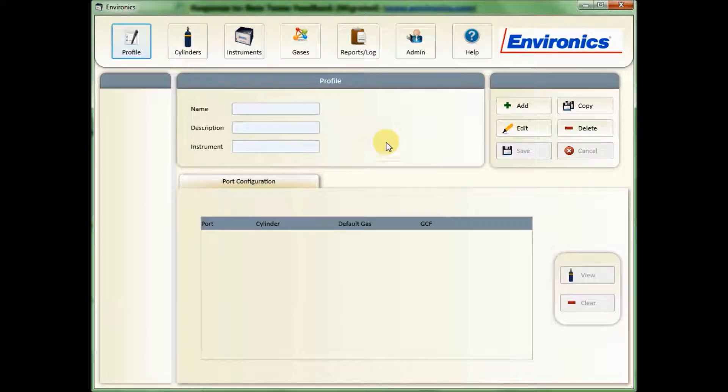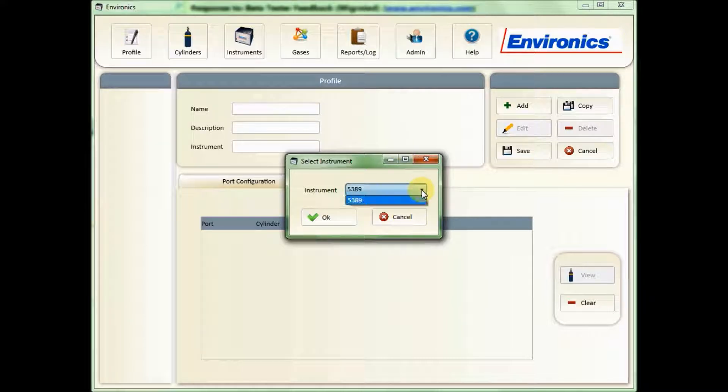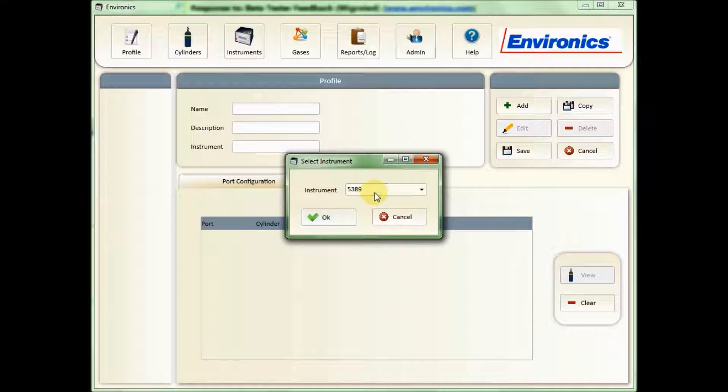The first step is to click on Add. The pop-up will then let you select the instrument that you want to set up a profile for. I only have one instrument inserted into my software, so that is the only one that comes up. If you have multiple systems, you'll have to choose it from the drop-down.